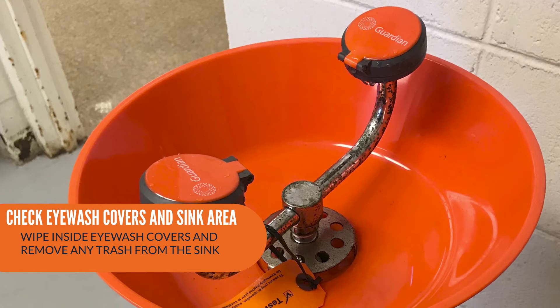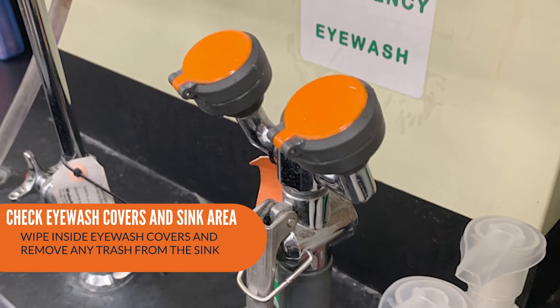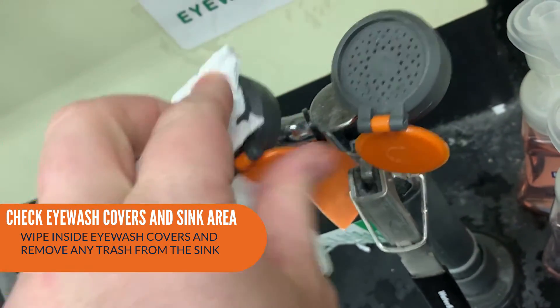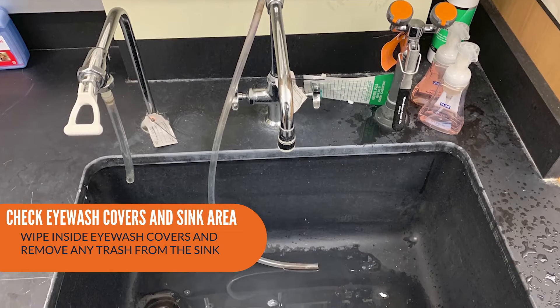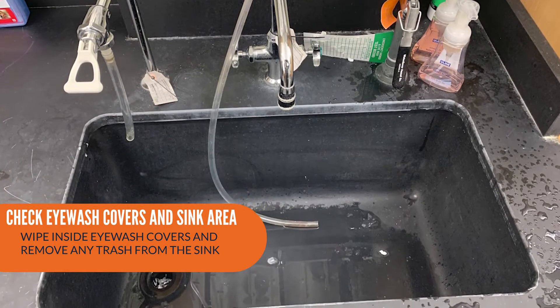Before turning on the eyewash station, inspect the eyewash covers and make sure they are in functional order. Check them for their position, cleanliness, and working condition. Lastly, check the sink area and spouts and make sure they are clean and free from trash.